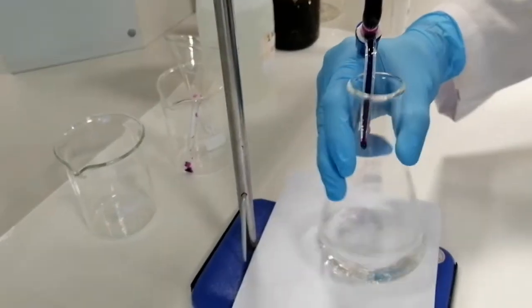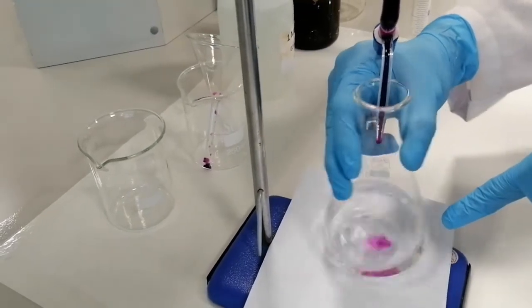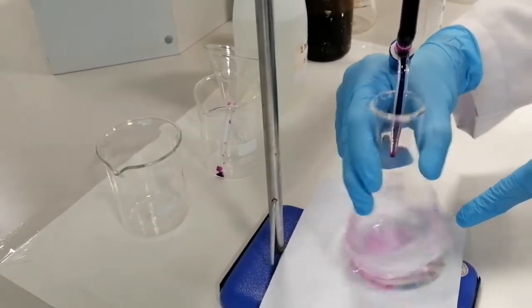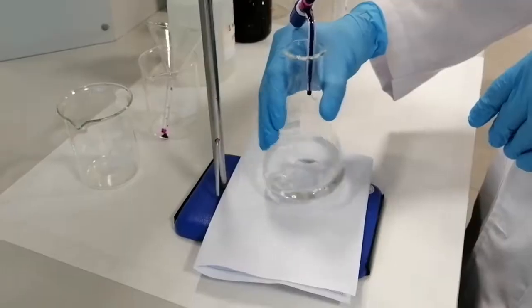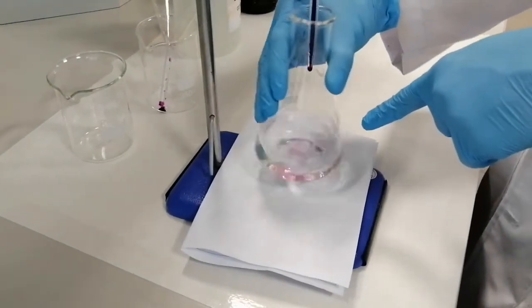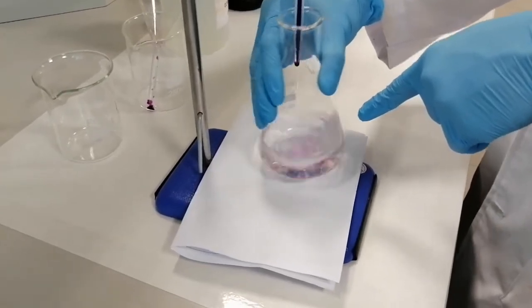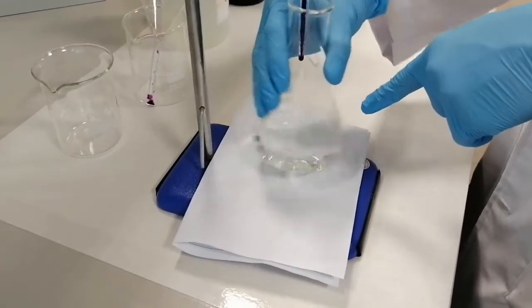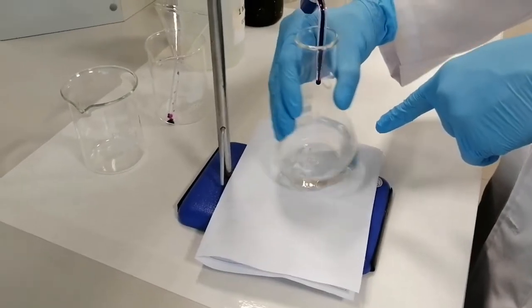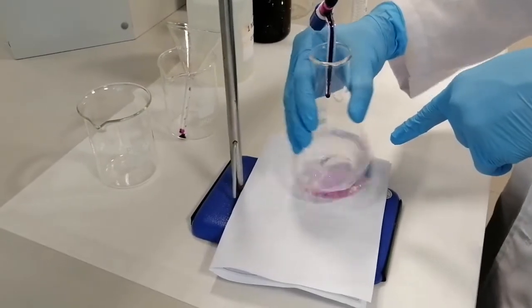Continuing the titration, adding potassium permanganate drop by drop — the color still disappears so I have to continue. Now the pink color starts to form and stay longer, but still vanishes, which means I'm getting close to the endpoint. I'm expecting that one drop will give a slight pink color throughout the solution that persists — that will be the correct endpoint.